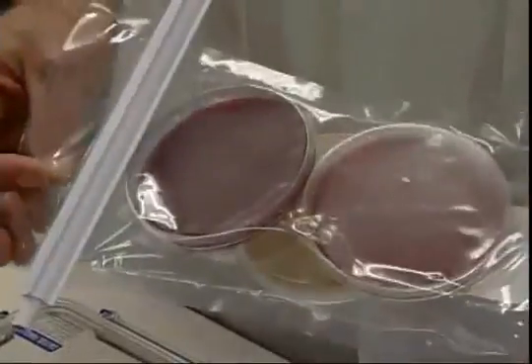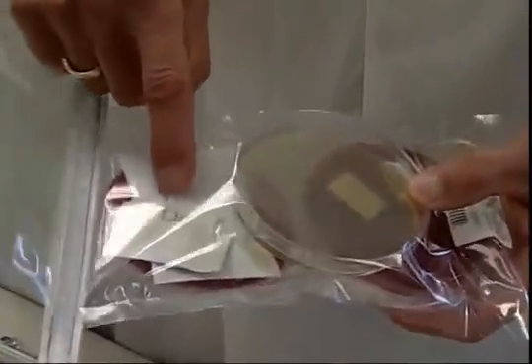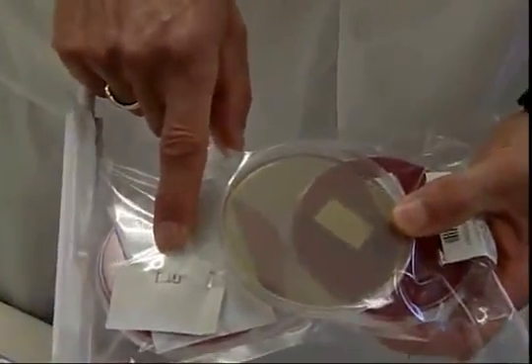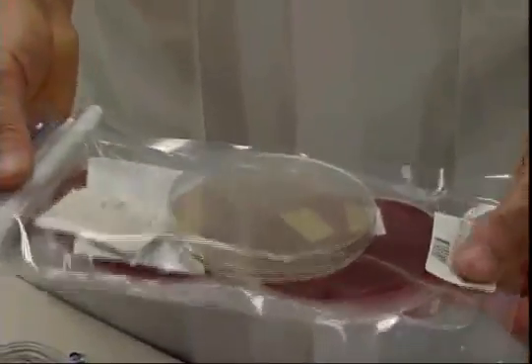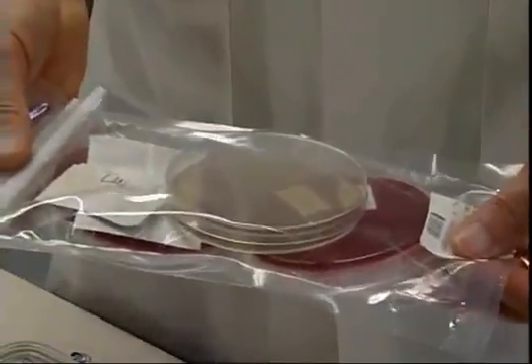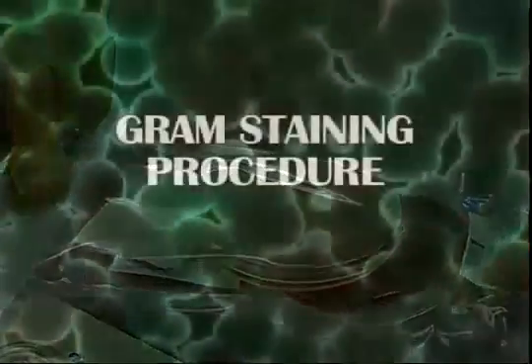For those special cases where anaerobes are specifically requested, we can use a gas pack. It's the same as one of these jars. It's got a smaller indicator and a smaller gas pack. As you can see, the indicator is white, meaning the gas pack has worked, and we can keep these going for 7 days, 2-3 weeks if necessary, to isolate any very slow growing anaerobes.